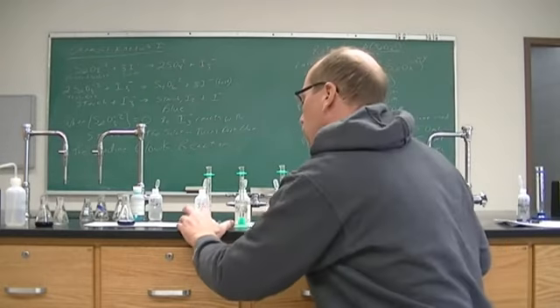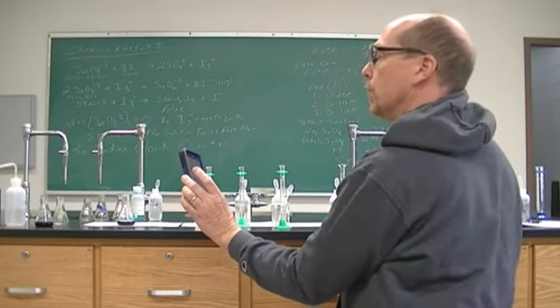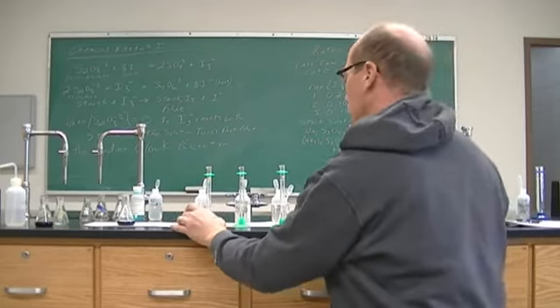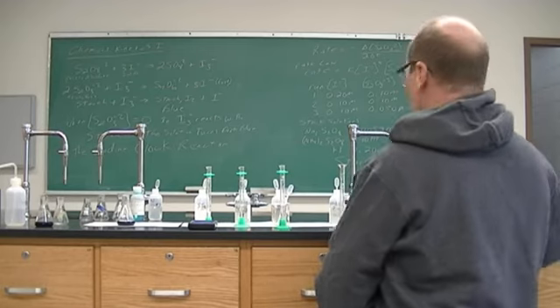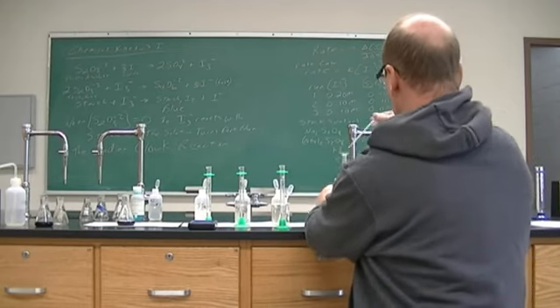Oh, and we are blue. All right, and so that, not sure how much I missed it by, but we are at 3 minutes and 8 seconds. All right, so now I'm going to put the 5 mils in here.